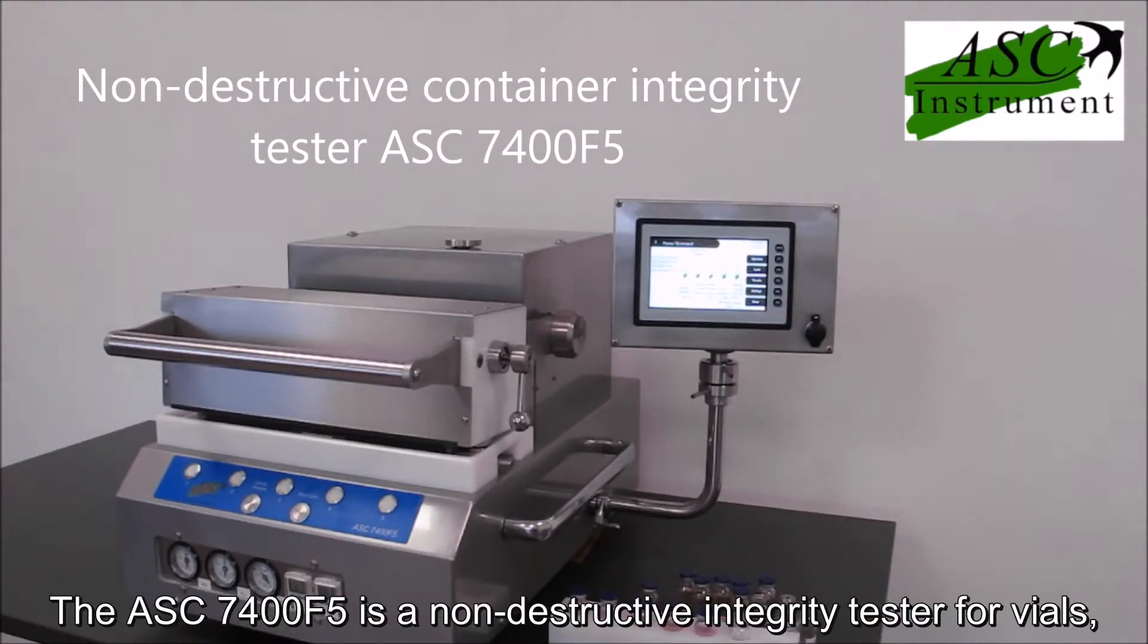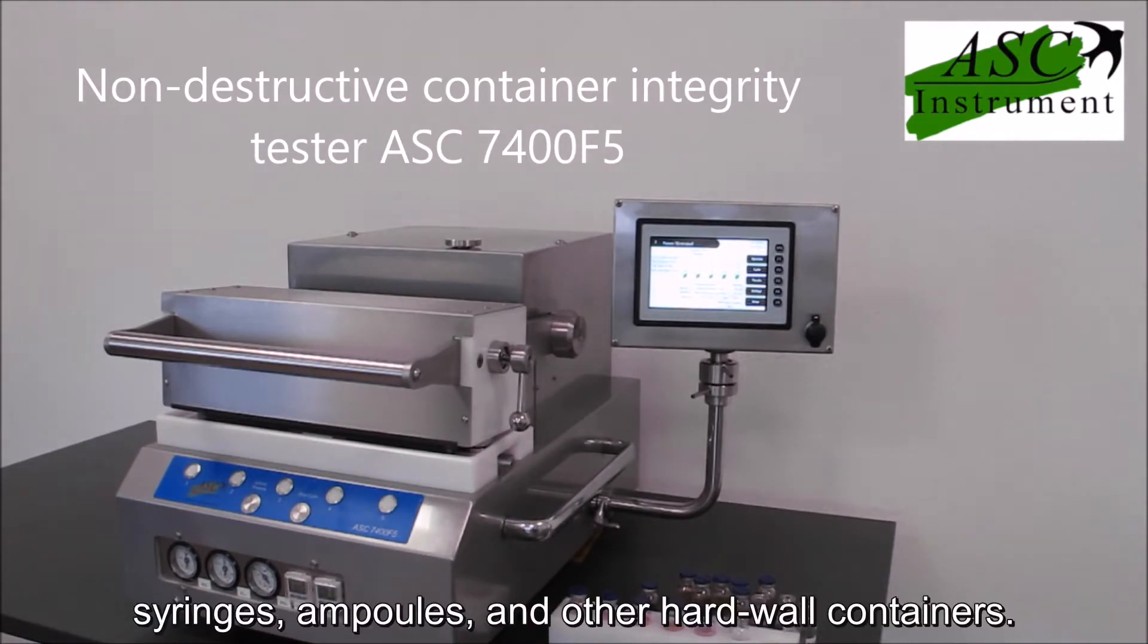The ASC7400F5 is a non-destructive integrity tester for vials, syringes, ampoules and other hard-wall containers.